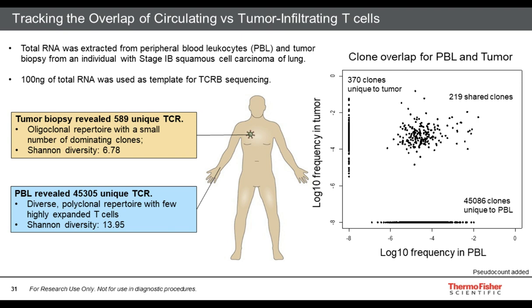This evenness metric is useful in the context of the tumor microenvironment in that we can look at it to help us understand if the tumor is repressive or permissive to an anti-tumor T-cell response. In a repressive tumor microenvironment, the tumor is somehow inhibiting an anti-tumor T-cell response, and in this scenario, one would expect to observe high evenness values following TCR immune repertoire sequencing. By contrast, in a permissive tumor microenvironment, the tumor allows for T-cell expansion and some anti-tumor activity, and in this scenario, one would expect to observe low evenness values following TCR immune repertoire sequencing.